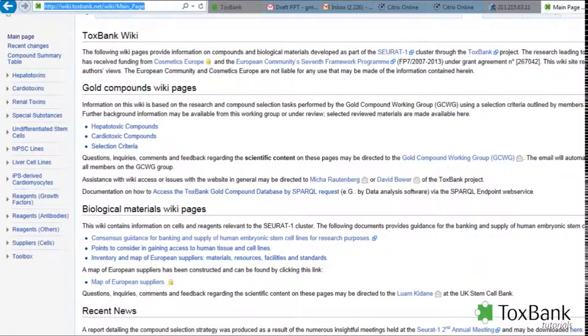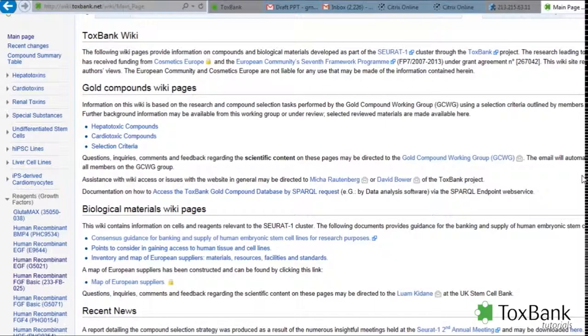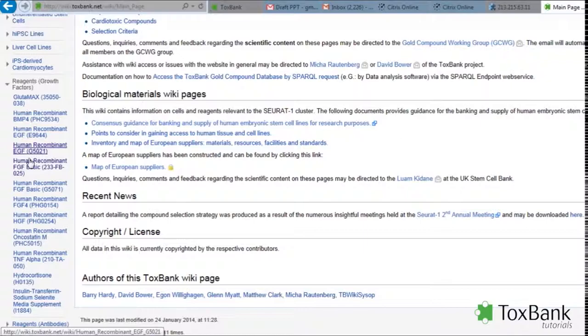On the left, there are three folders that discuss reagents: growth factors, reagents, antibodies and other. Opening up any of these folders will provide a listing of information on what's available.